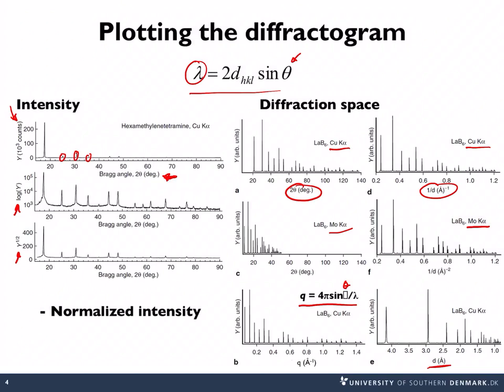Another option is to plot as a function of D. Here we see directly the interlayer spacings, the spacings between the miller planes in the structure. This can be quite useful, because we can directly read these distances in Ångström, but when we come to the low interplanar spacings, we don't really see anything.